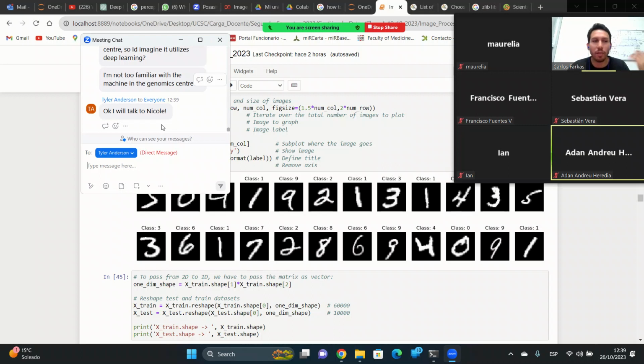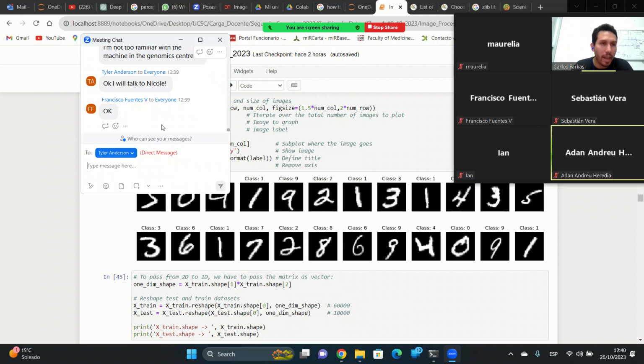In the very last class, I would like you to present briefly, 5 minutes, sharing your screen, what you have done. If you want to do deep learning, what we can do with that, or if you can do puncta counting, we already covered that, or segmentation, and so on. So next class we will see how this deep learning behaved in terms of counting the nuclei and segmentation. Probably there are better tools, but we'll see how the deep learning goes. And then we will try to load your images and see what's going on in Python. My guess is it will be fluorescence quantification, and probably shape and cell clustering as well.